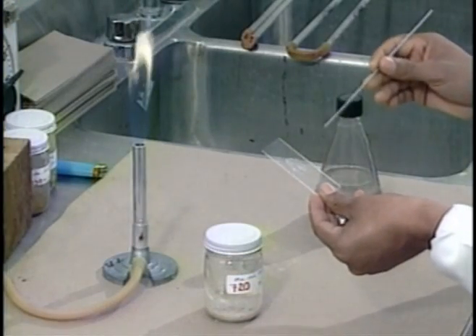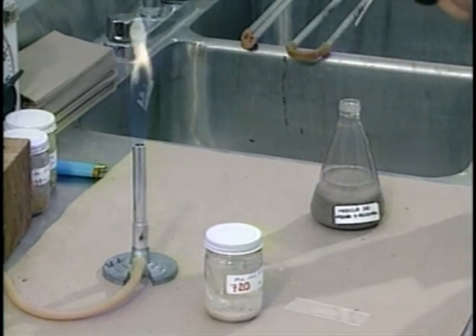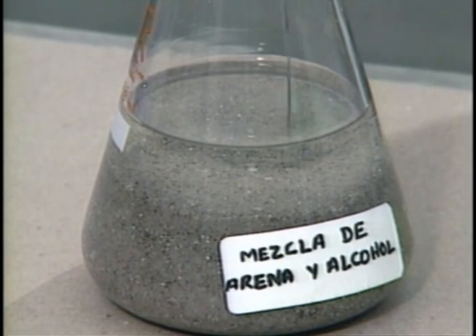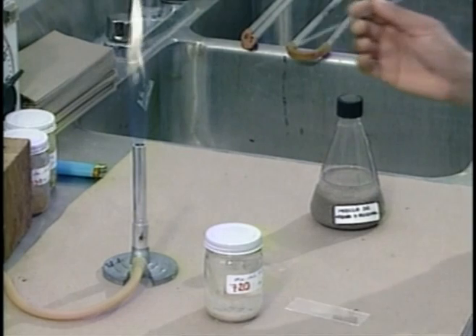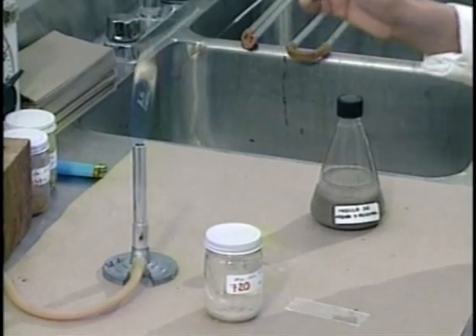If a wire loop is used, clean it before the next use. Dip the contaminated loop into a sand and alcohol bottle and move it up and down to remove solid debris. Next, heat the wire loop in the flame until red hot. Allow it to cool before using it again.